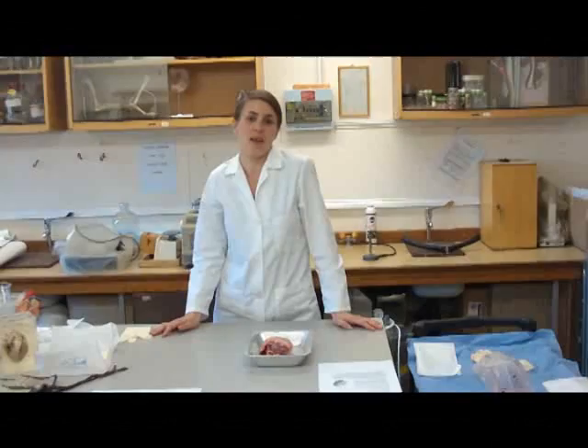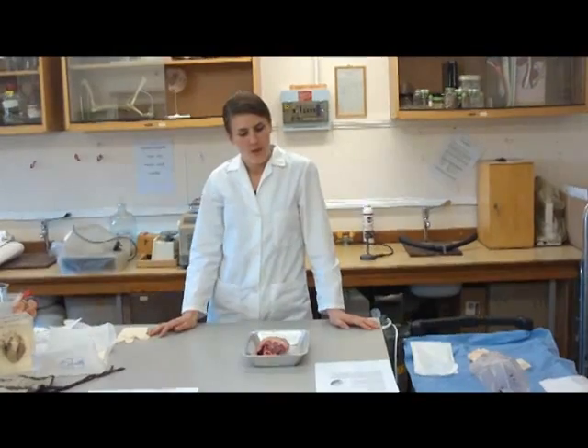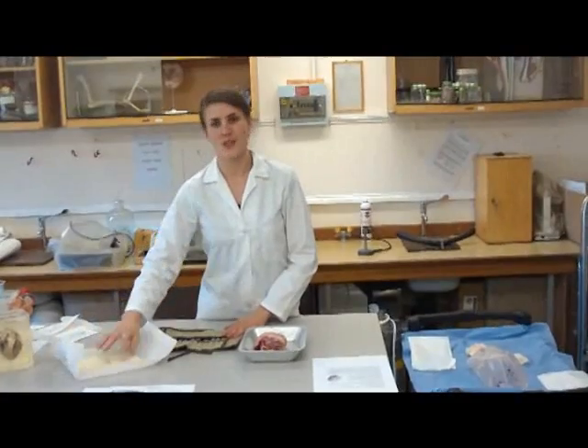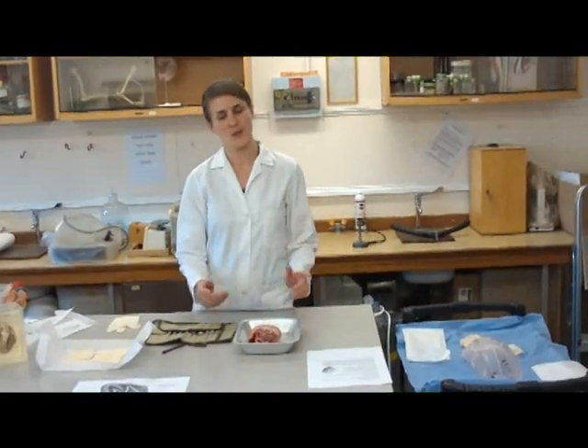What we're going to be doing today is a dissection of a pig's heart. The equipment that we're going to be using is a dissecting kit, surgical gloves, a tray to put your heart in, and of course the heart.